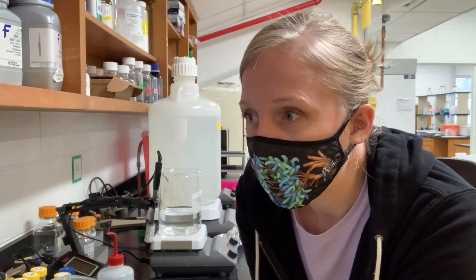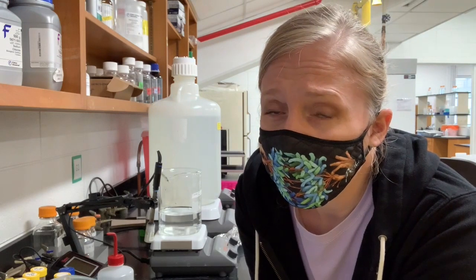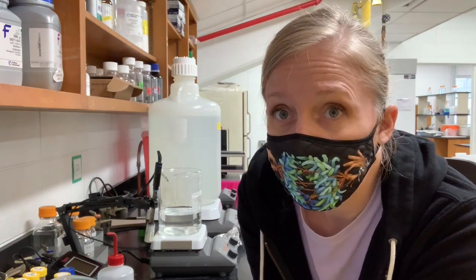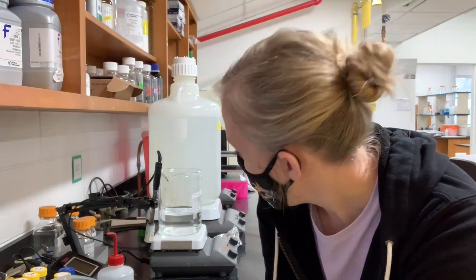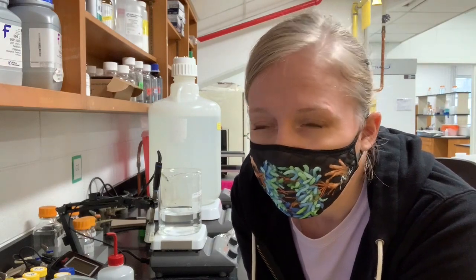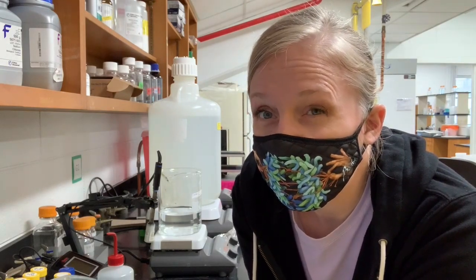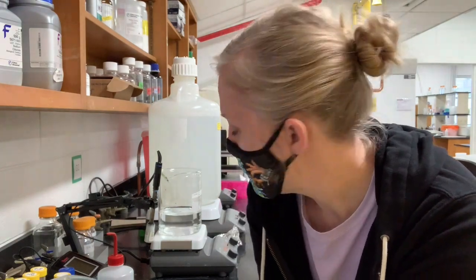Occasionally, you can also speed along the process by adding heat. Be very careful when you're doing this, because that will affect different chemicals differently, and there are some chemicals that can be ruined by high heat. So for PBS, most of the solutions that we make in the lab, heat's not required. A saturated 5 molar NaCl solution might be the exception to that for the things that we make on a routine basis.